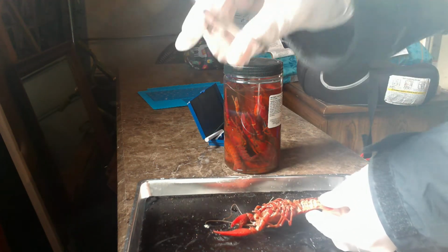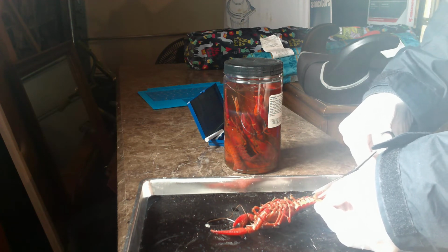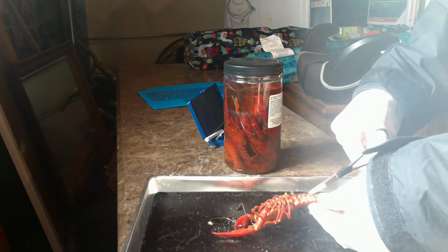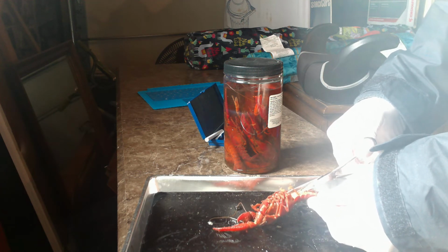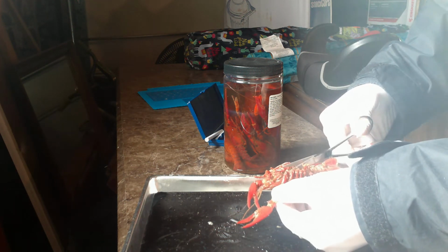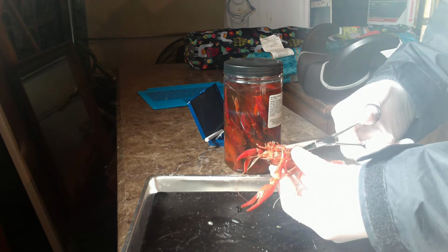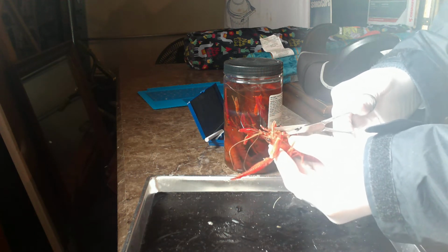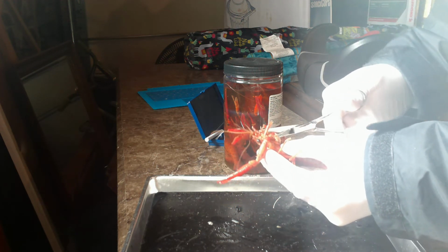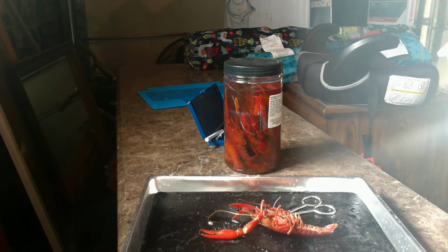So what I'm doing is I'm just taking my scissors and just starting towards the tail, and I'm gonna cut my way up. Might need to use a scalpel. Oh, no, there we go. Off to the side of everything. There we go. Open this guy up. Yeah, get some pins.